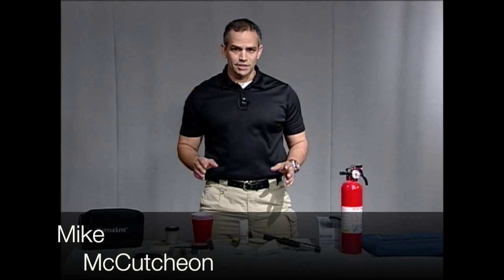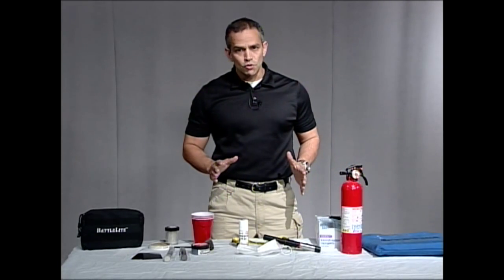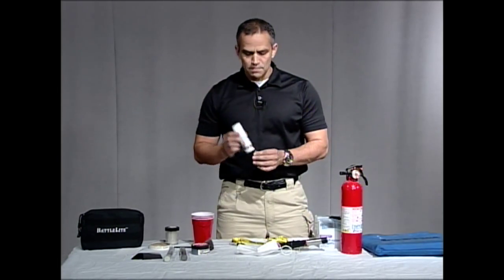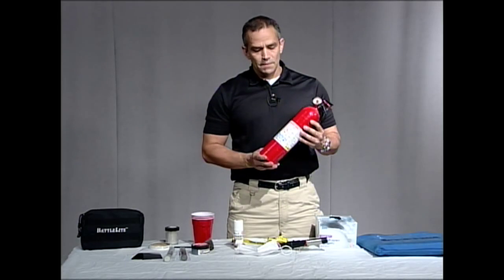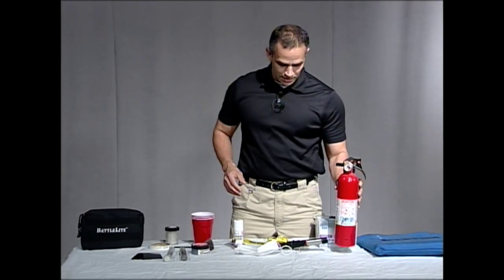Hi, welcome back to Forensic Education. I'm Mike McCutcheon and I'm going to be your instructor today. I've got a great show planned — we're going to use three items: I'm going to teach you how to use the fuming wand, we're going to use some powder puff spray or aerosol fingerprint powder, and then I'm also going to show you how to develop fingerprints using a fire extinguisher. I know it sounds crazy, but it can be done.